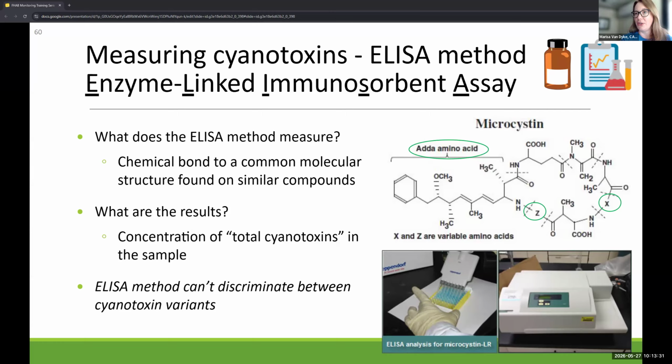It's going to provide you units in micrograms of toxin per liter of water, or also parts per billion, again how we get units of chemical in water samples for other monitoring, like for pesticides. So when you're looking at toxin analysis, think of the toxin like any other chemical for analysis when you're speaking to a laboratory and debating which method to use.